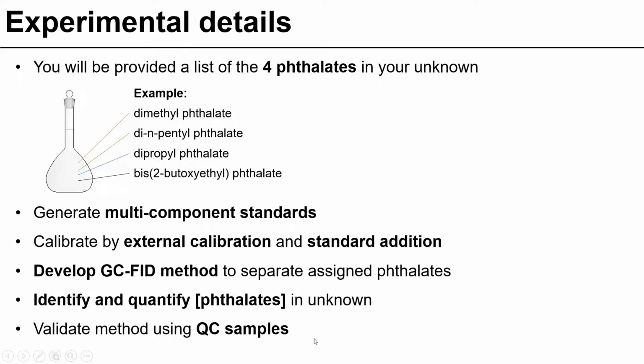And finally, we're going to use some of those quality control samples that we've been using all semester to validate this method. So are you getting good recovery? Are you getting any matrix effects? Do you have a low MDL? Is there any blank contamination? We're going to check for all of those things to validate this method.